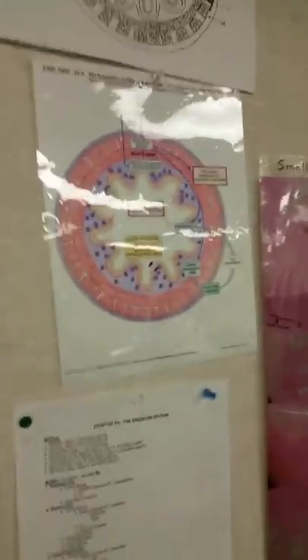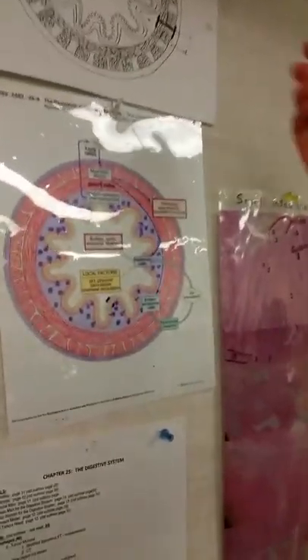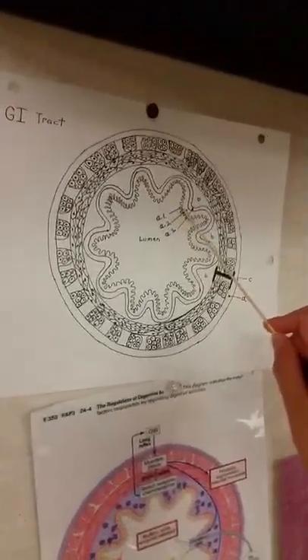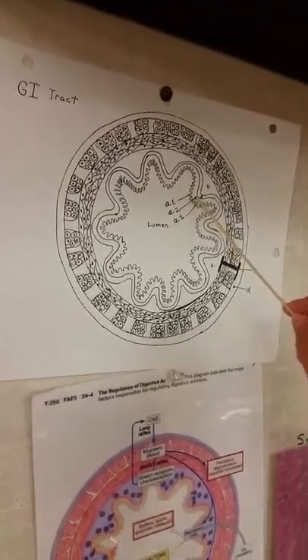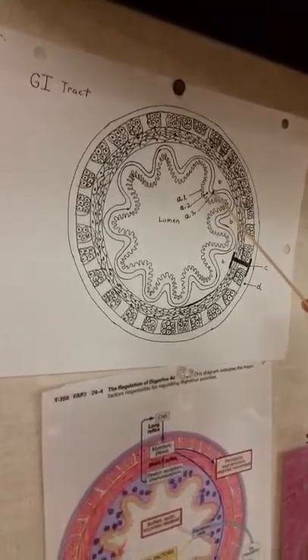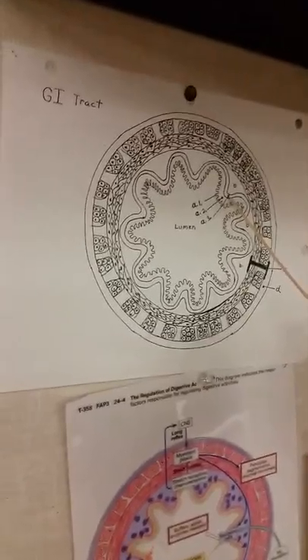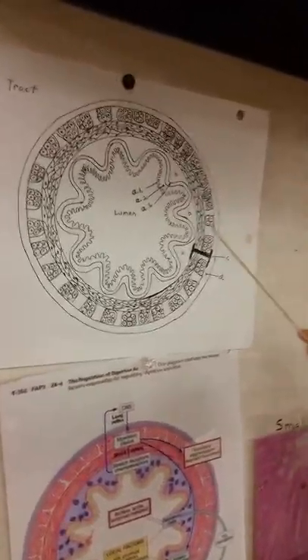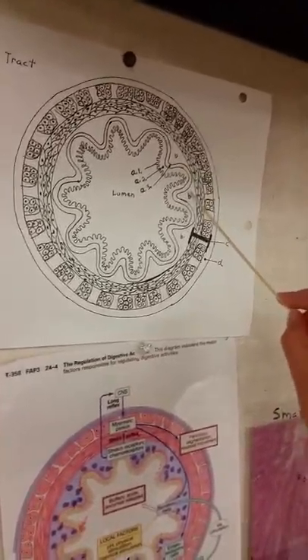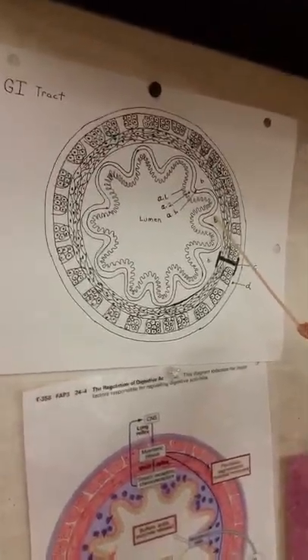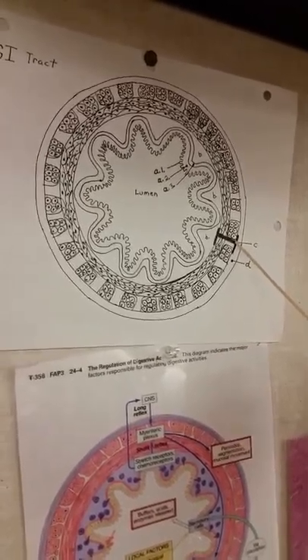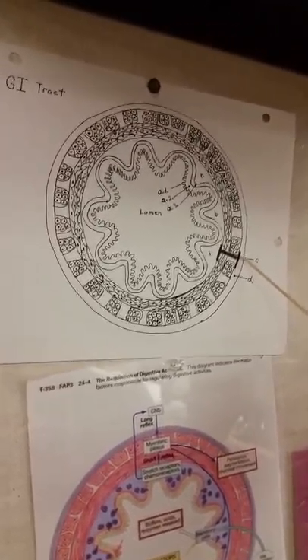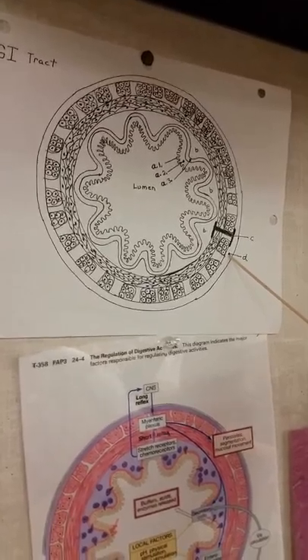Moving on to the GI tract, which is up here. This would be the epithelial tissue. This would be the connective tissue. This layer here would be the muscularis mucosa. And this here would be the tunica submucosa. This layer here would be the tunica muscularis. This layer here would be the tunica serosa.